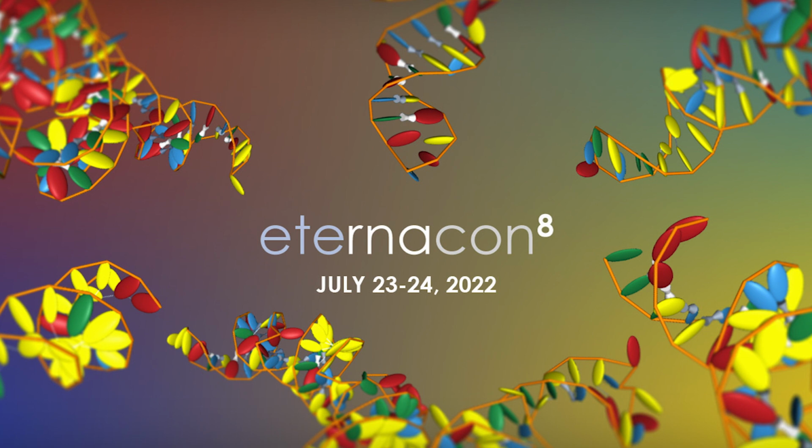Right. Okay. There are actually two versions, and I have to just say thank you so much for making me aware of ChimeraX, because I hadn't stumbled across that. I mean, the UI is clearly going to be much more user friendly. I'm eager to find out what other things. So it's possible that whatever I say may not be entirely true anymore.